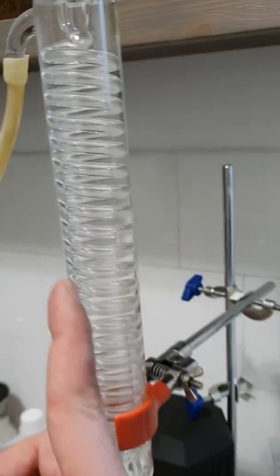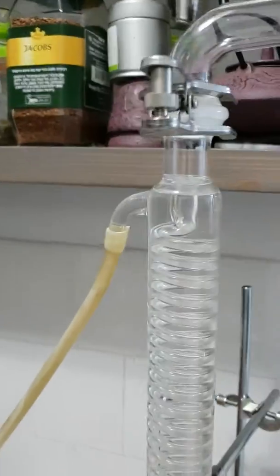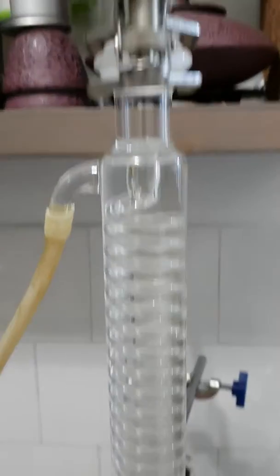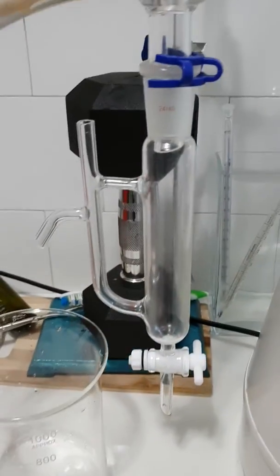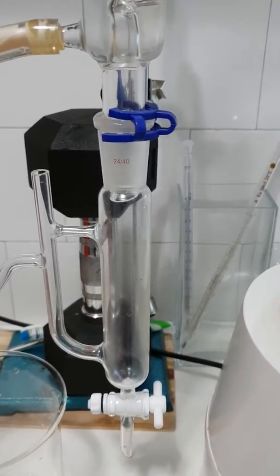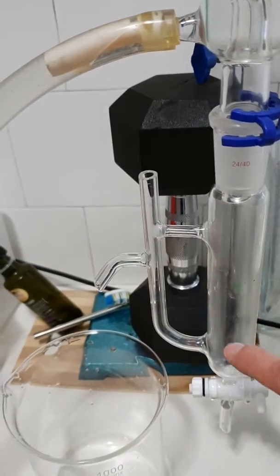The condenser has cold water running through the external part of the tube. The vapor arrives at the condenser, which is cold, and the steam turns back into water. From there it drips down, and the oil separates from the water — the oil will typically sit on top.